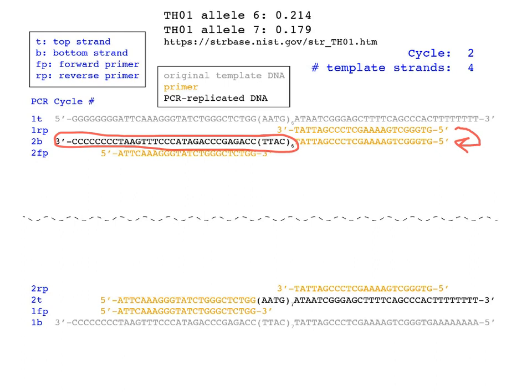In terms of actual number of primers, we have two different sequences, but how many of each of those do we have to have in the test tube with the DNA to do this process? Lots. Right. Generally speaking, it's not two, as shown on this screen. This is just the first round. Would use two pieces, two individual molecules of primers, but after you do this 20 times and you do exponential growth, you do literally need millions plus of each of these two primer sequences, because every time you start synthesis of the second strand with a primer, you have to have a molecule of that primer.